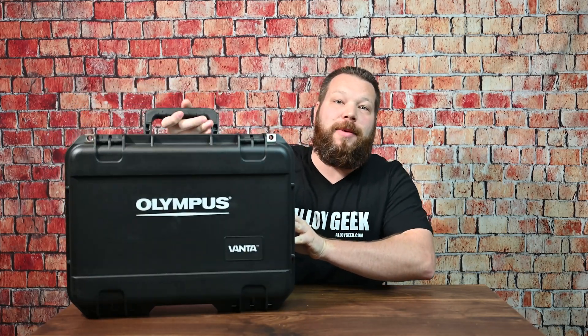Welcome back to AlloGeek. In this video, we're going to take a look at the Olympus Vanta Element S.